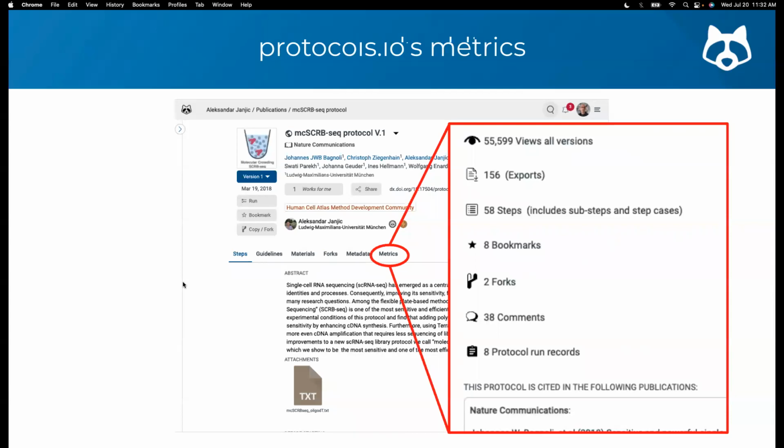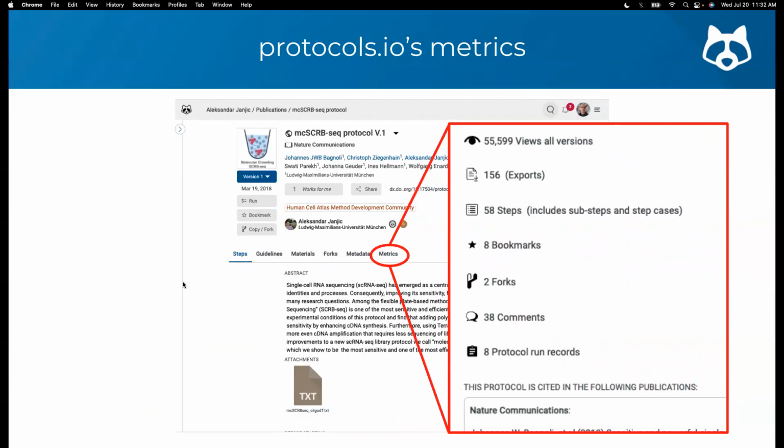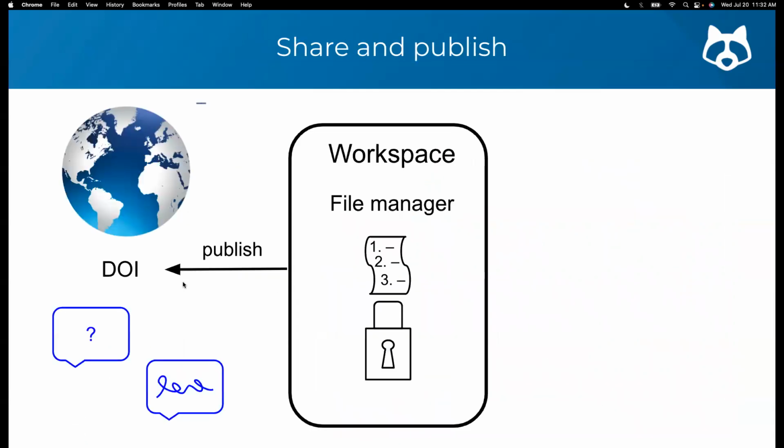Any reader can comment or ask questions, as I showed you earlier, and the authors will be notified. And this will expand your network of collaborators and strengthen your impact and reproducibility.